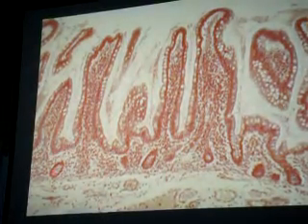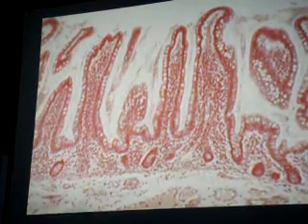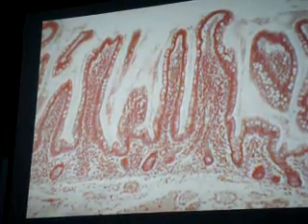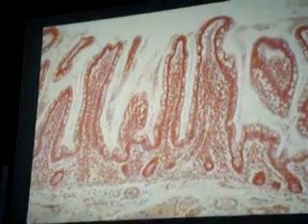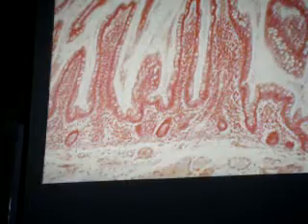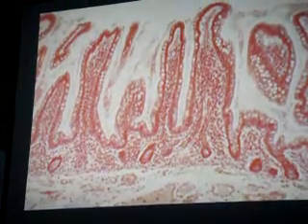What is this? Is it an epithelium? If it's an epithelium, what type of epithelium is that? Glandular epithelium. So it's a gland. So remember, your lining epithelium invaginates, in this particular case, in the wall of the GIT to form your intestinal glands. So those tubular structures that you see in the lamina propria are what? Glands.